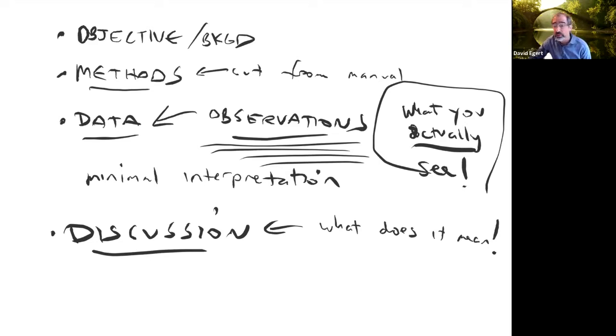We're going to mix them up. We're going to try putting electric currents through them. We're going to do all sorts of stuff. You're going to get all this data on what happens as you mix and match these different things. But then in your discussion, you're going to have to bring it all together and talk about the bigger picture. What is this telling us? Why does this make sense? How is this illustrating the basic concepts that I was talking about in lecture this morning?